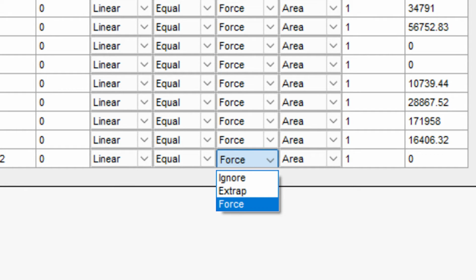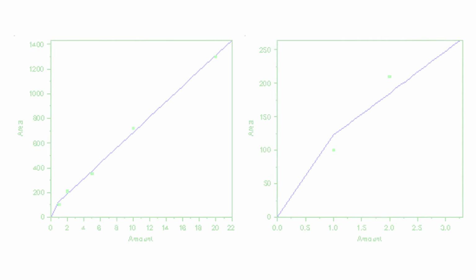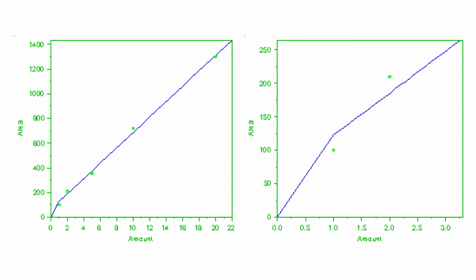If the origin field is set to extrapolate, then the calibration curve has 2 linear segments, using the usual regression line for medium and high levels. For amounts less than the amount of the lowest level point, it uses a straight line between the origin and the line. This scheme has the advantage that the calibration curve is optimal at high levels, but it suffers from a discontinuity in slope at the lowest amount, where the 2 lines intersect, as shown in the following figures.